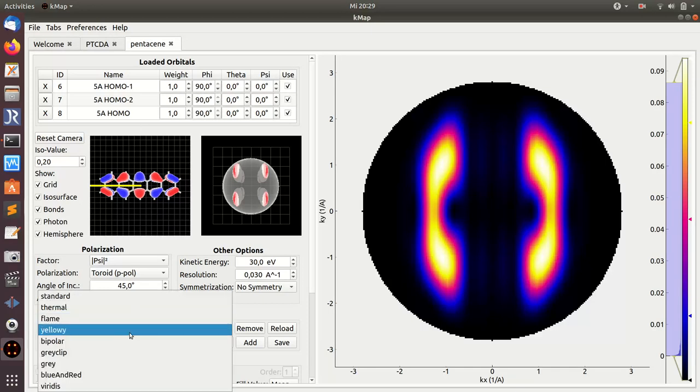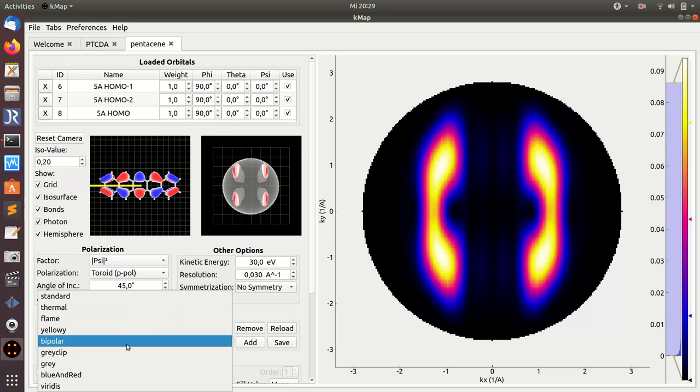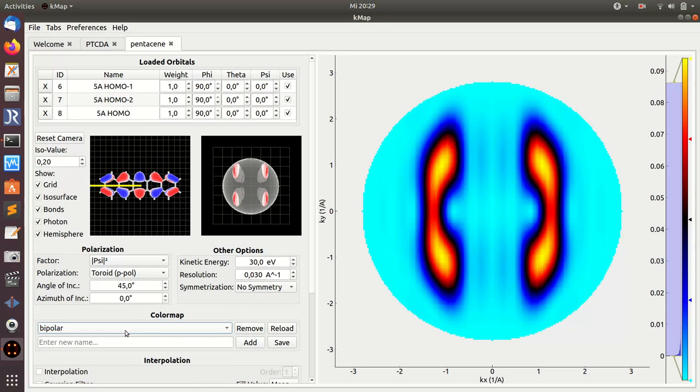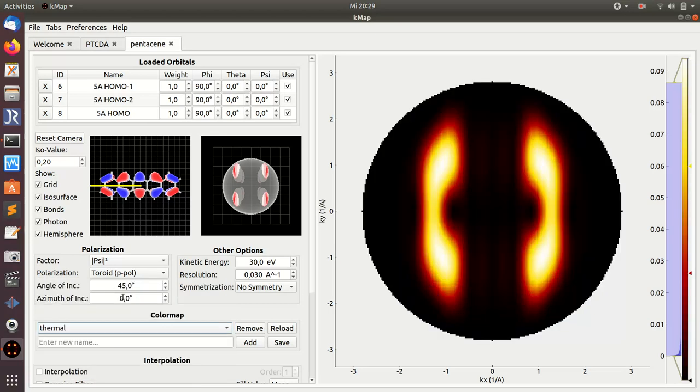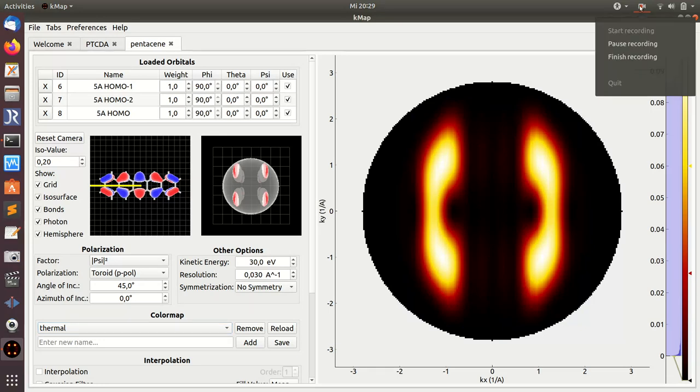This is trivial. You can also change the color map here, but maybe I'll show you some other time. Okay, this was the first part of my tutorial about the orbital data tab.